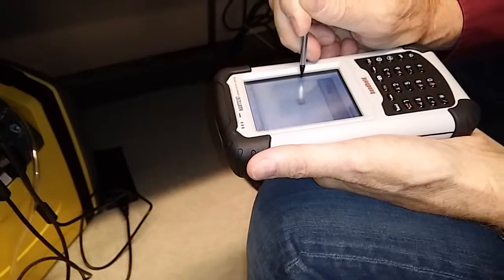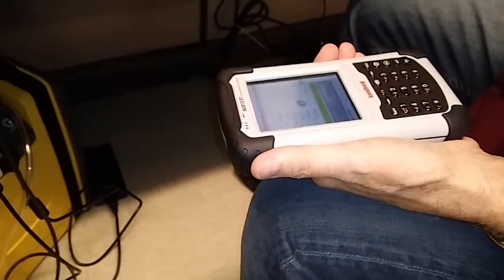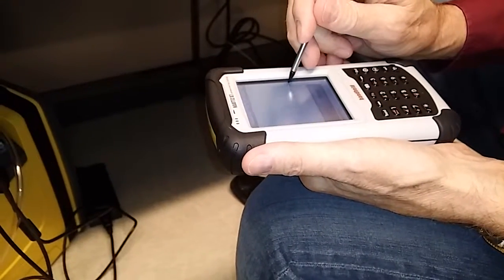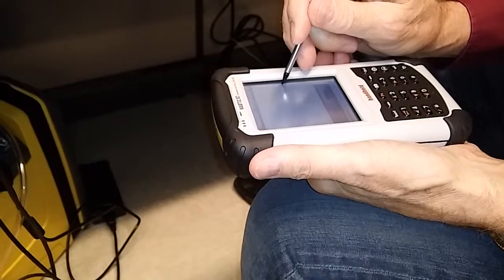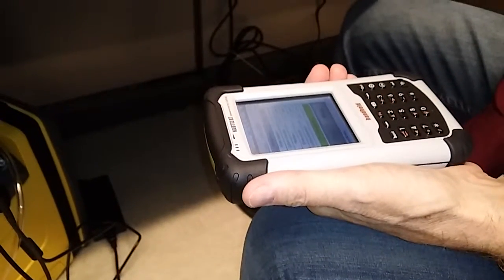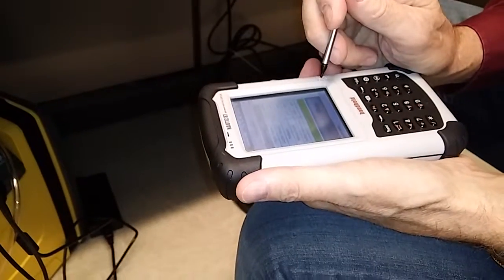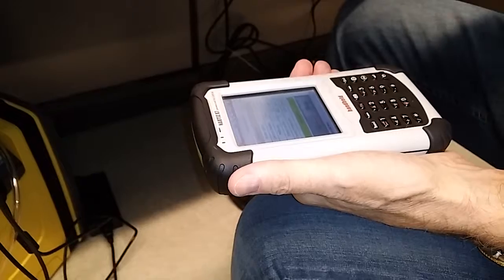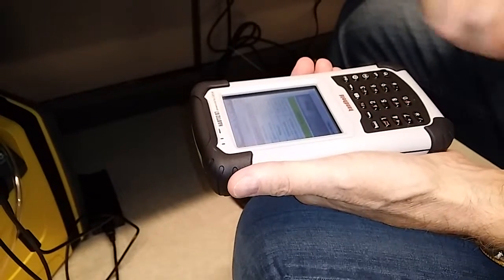Your formaldehyde is minus 0.03. Oh, according to the calibration, carbon dioxide is minus also. Oh, that's the last cal we went through. Carbon dioxide, yeah, now 324. Now increase. Yeah, this is continuously monitoring now. Continuous.